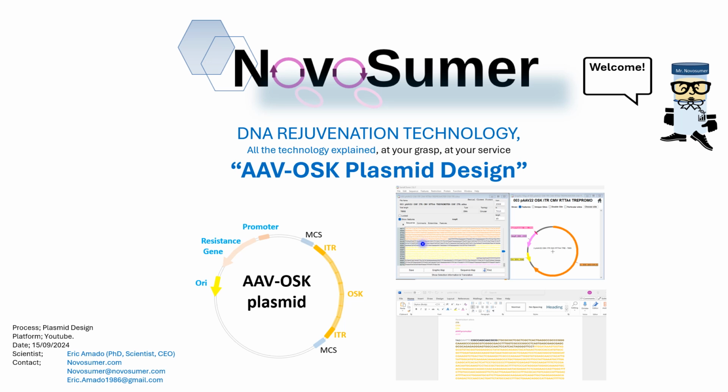You see here the sequences, one after another. They are highlighted in colors. For example, this sequence corresponds to this one, this sequence corresponds to this one, and the same here. Instead of using a specific text editor, you can use just Word, like in this picture.